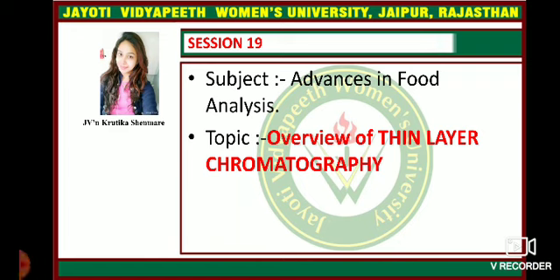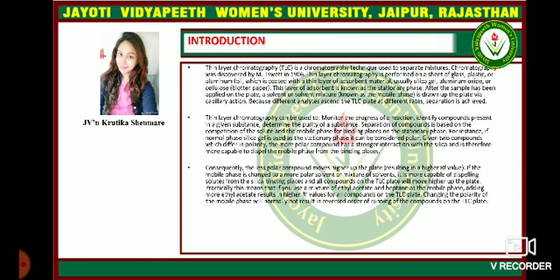Hello everyone, this is the 19th session of the Advances in Food Analysis, and the topic which we'll be covering today is the overview of thin layer chromatography. Talking about the introduction of thin layer chromatography, it is a chromatographic technique used to separate mixtures.